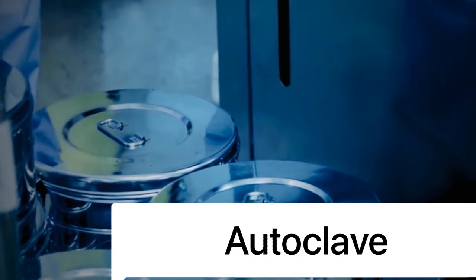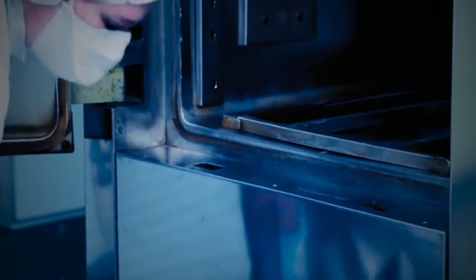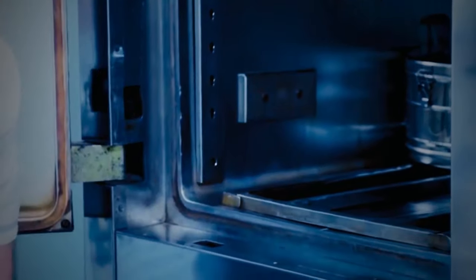Autoclave. An autoclave is used to sterilize surgical equipment, laboratory instruments, pharmaceutical items, and other materials. A very basic autoclave is similar to a pressure cooker. Both use the power of steam to kill bacteria, spores, and germs resistant to boiling water and powerful detergents.